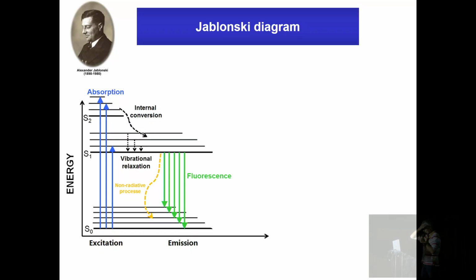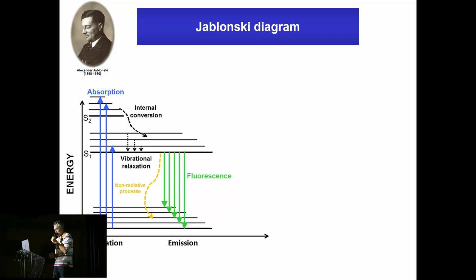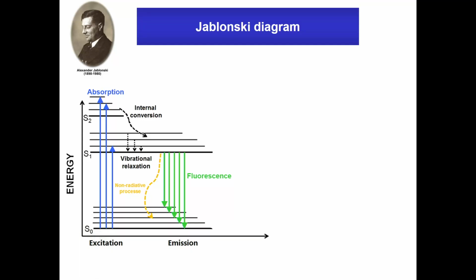The idea of this diagram is that if you have a fluorescent molecule, a fluorophore, it sits in the absence of light in a so-called electronic ground state, S0, which is a singlet state, that's why S. In this S0 state, it also has some vibrational levels that typically cannot be reached at room temperature, and which can be reached by some kinds of spectroscopy like Raman spectroscopy or infrared spectroscopy.